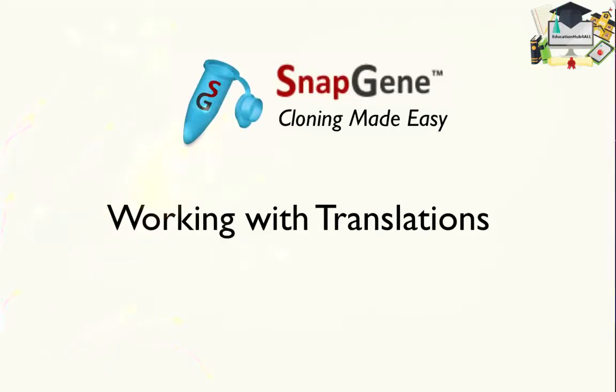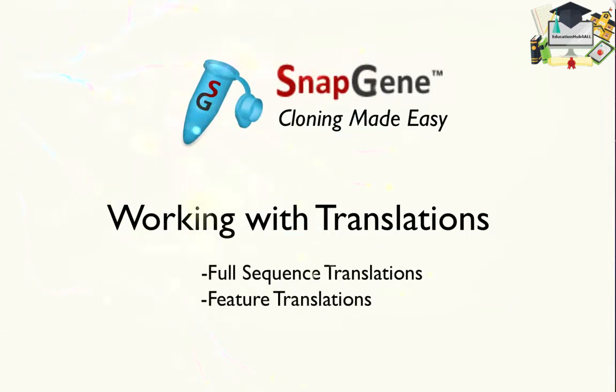Translation of DNA to protein is one of the most important functions of SnapGene. Our software supports two types of translations: full sequence translations and feature translations. Let's start with full sequence translations.